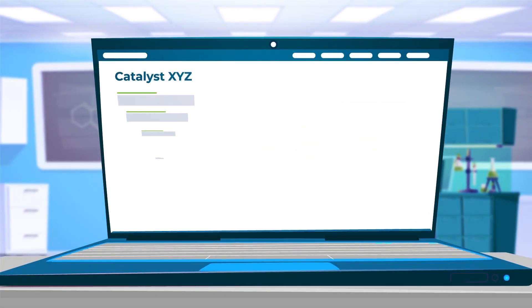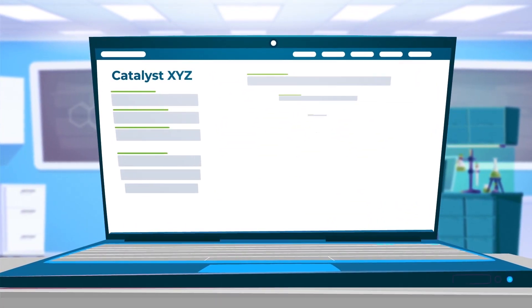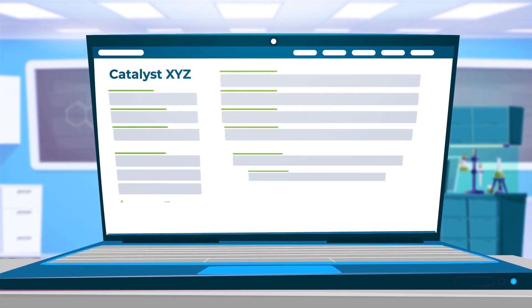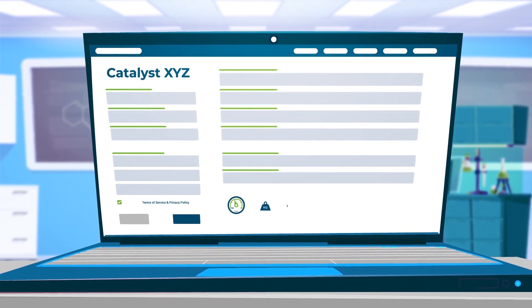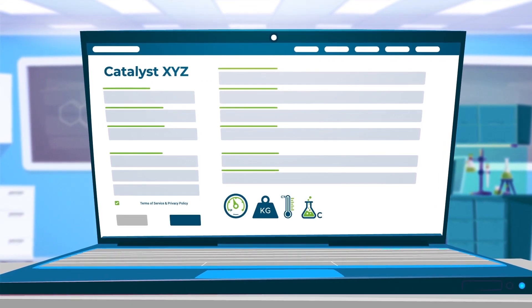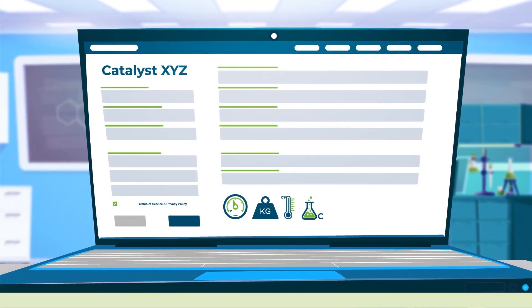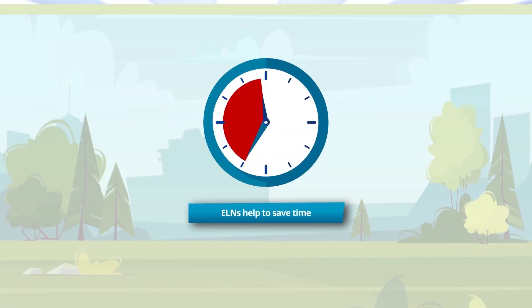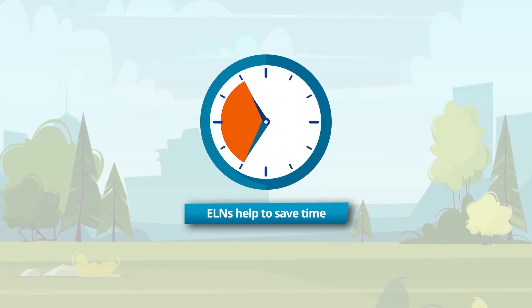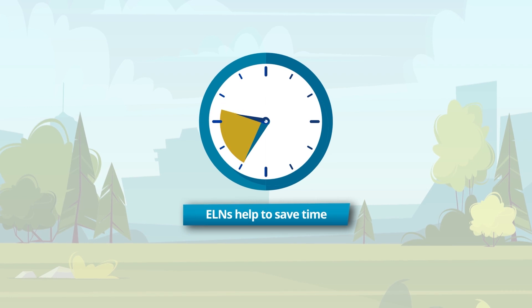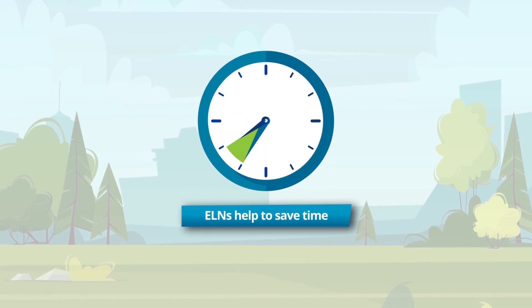To make working with an ELN even easier, templates and presets can be configured and shared for every experiment. In addition to saving time, ELNs make archiving data safer.